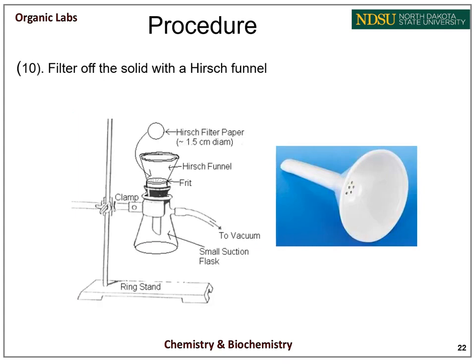Step 10. Filter the solid using the Hirsch funnel, and this is the vacuum filtration system that I showed to you before. The only difference is that we're using a Hirsch funnel this time, which is the smaller white one that you have in your drawer.